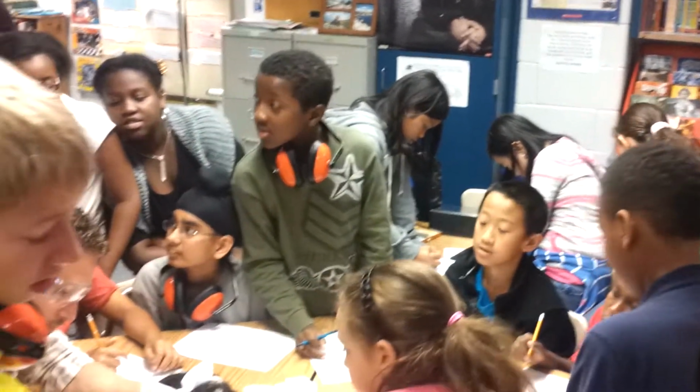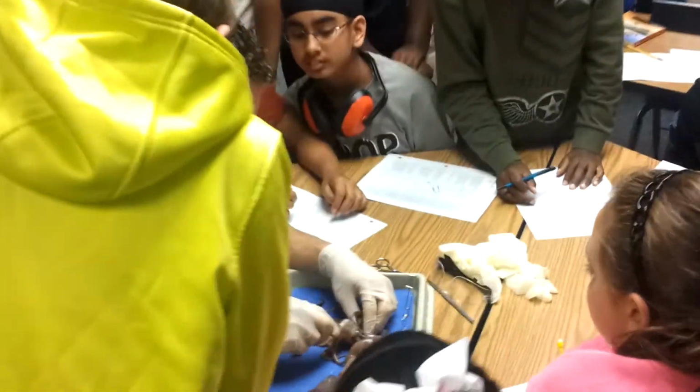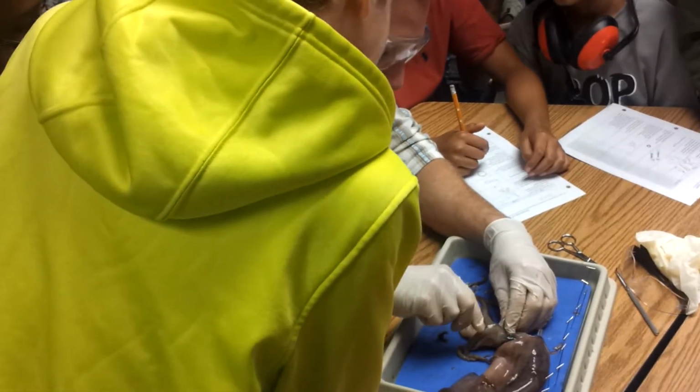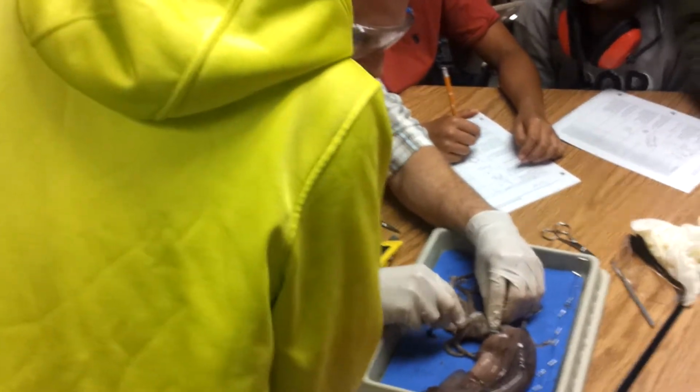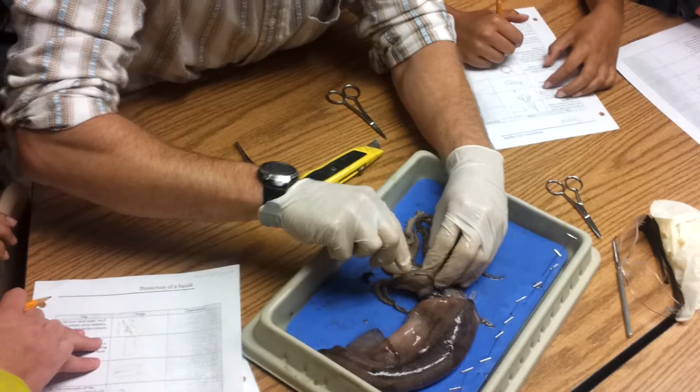No, that's what calamari is. Well, it's slippery. Just push on that and then pull it over there. You don't want to squeeze the eyeballs. I'm more afraid of the juices flying out. Pull. Okay. Put that thing on his head.